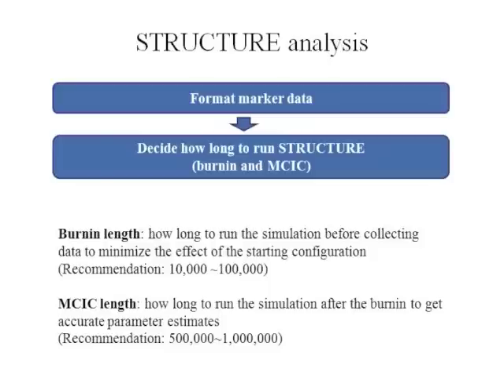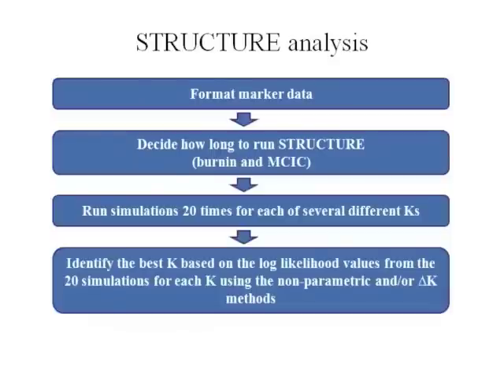The recommended burn-in length is 10,000 to 100,000. MCMC length is how long to run the simulation after burn-in to get accurate parameter estimates. The recommendation for this length is 500,000 to 1 million.